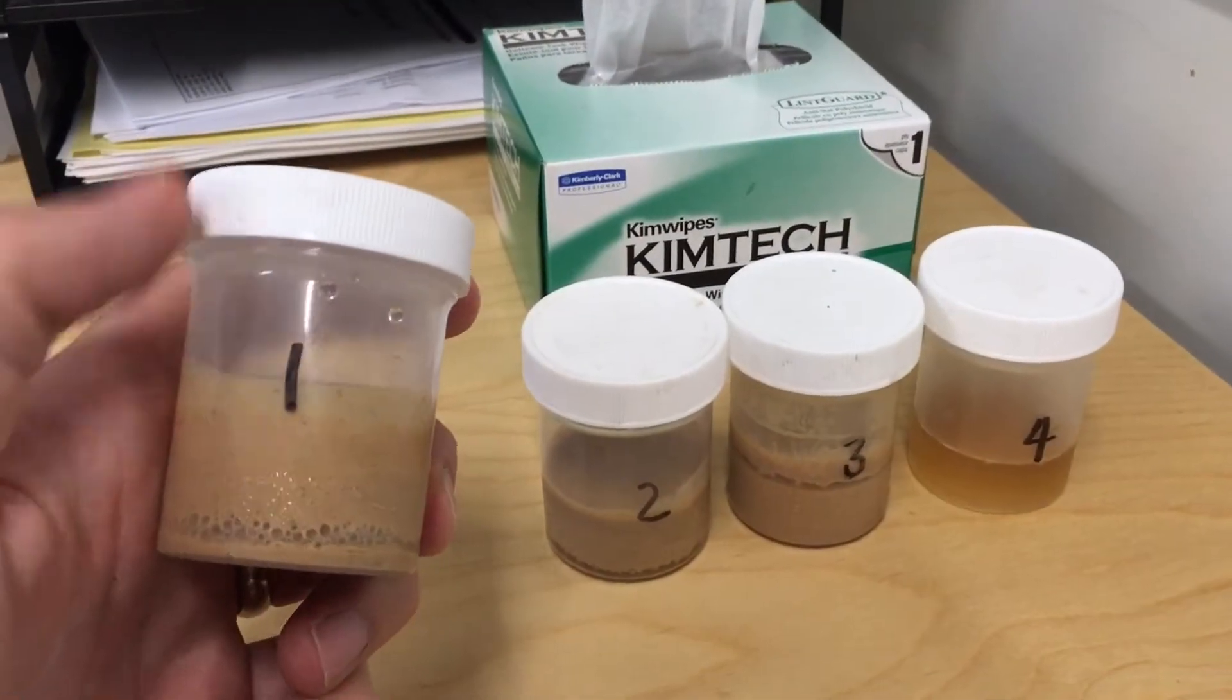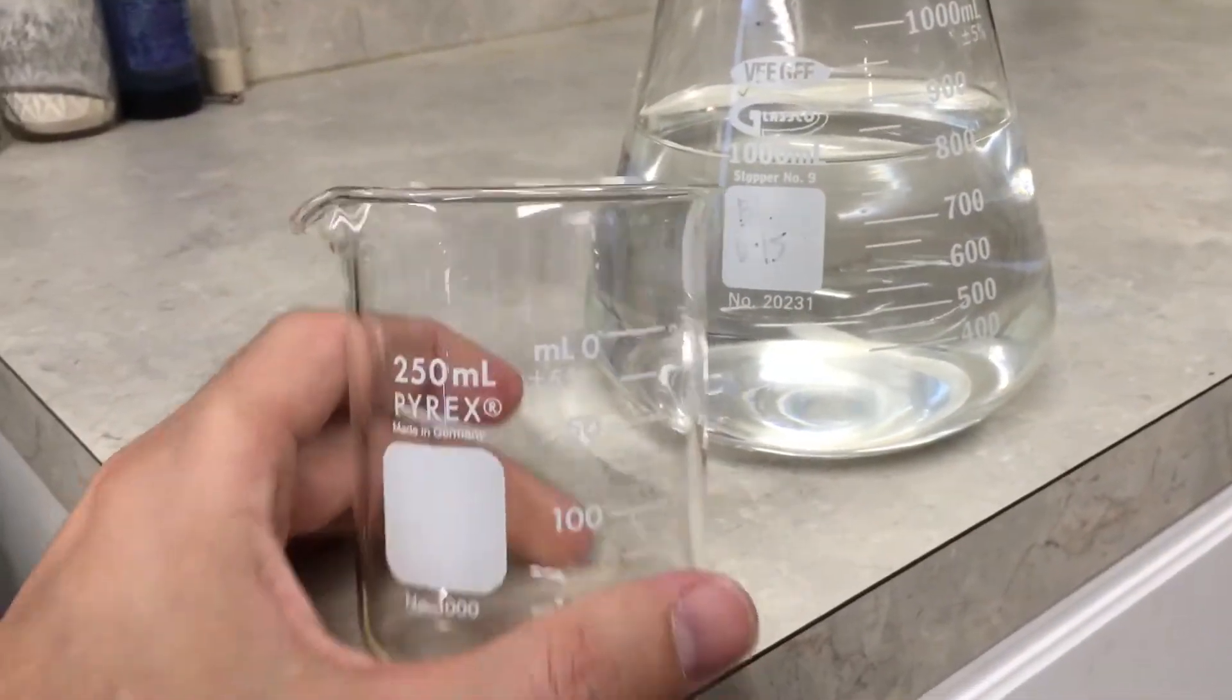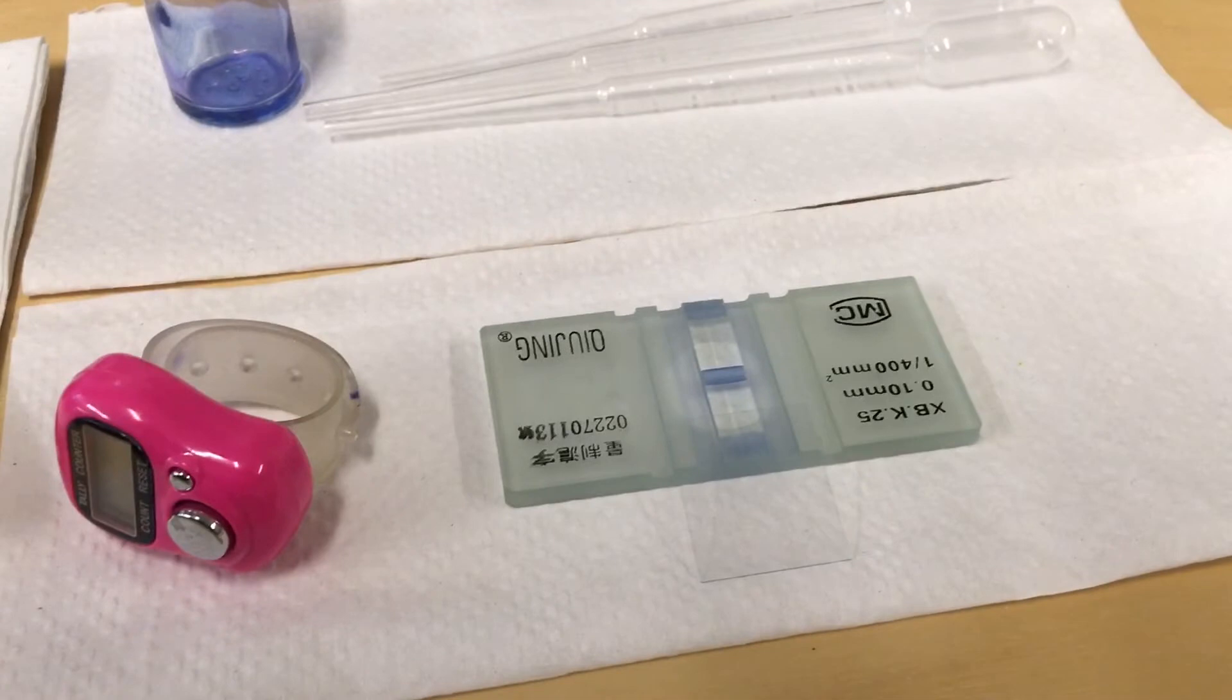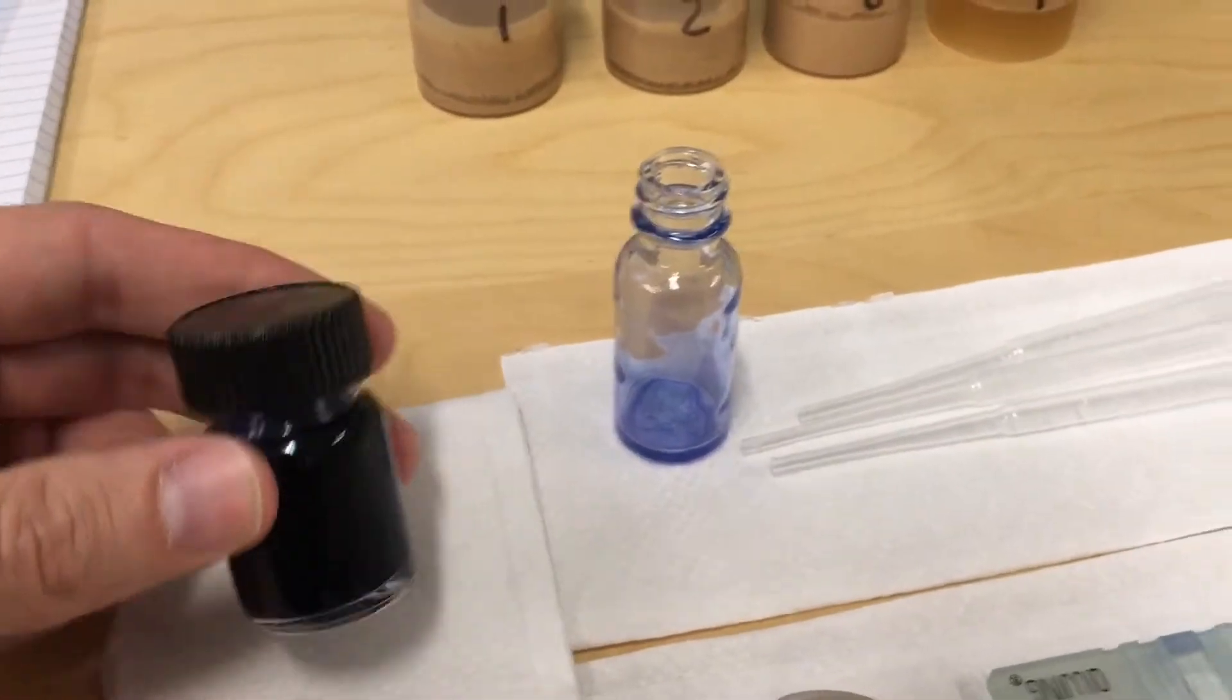So you'll need a sample of your yeast slurry, a beaker for dilution, your hemocytometer, a counter, and some pipettes, and your viability stain.